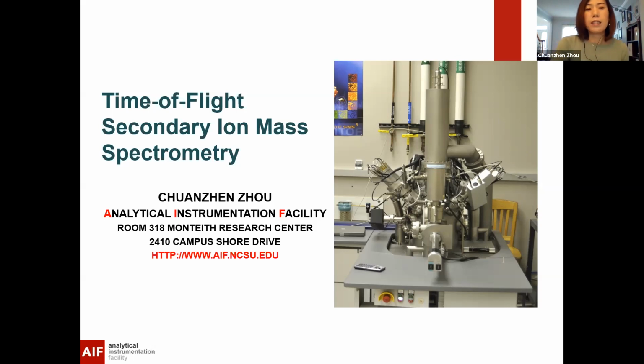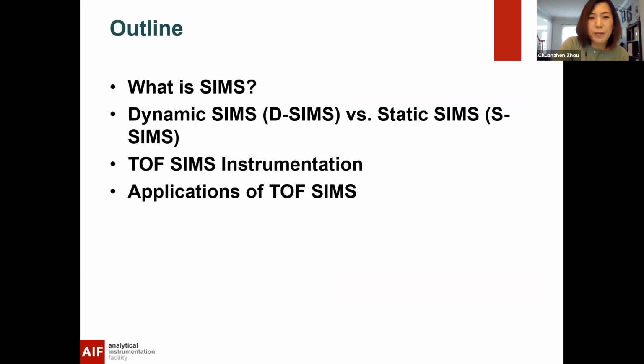All right, so today I would like to talk about time-of-flight secondary ion mass spectrometry. This is one of the instruments in our surface analysis lab. We have had this instrument for more than 10 years, and it's still in very good working condition right now.